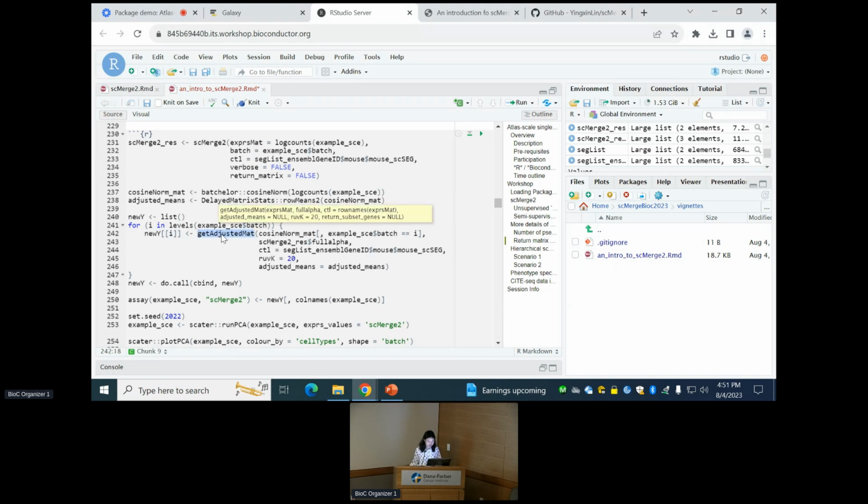It's not problematic, it's just slow and it will eat up a lot of memory. So I usually do it by batches, and you can even split it into 100,000 cells each time.